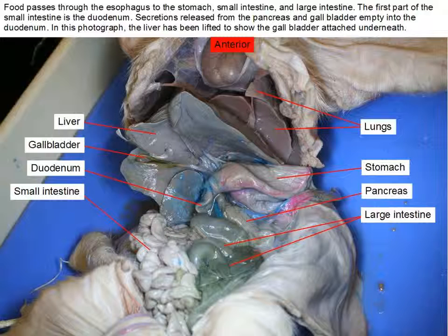Later we'll ask you to follow the path of air, then the path of blood through the heart and the veins, then the path of the germ cells and so forth. So all these different systems, be able to be tracing them from start to finish.